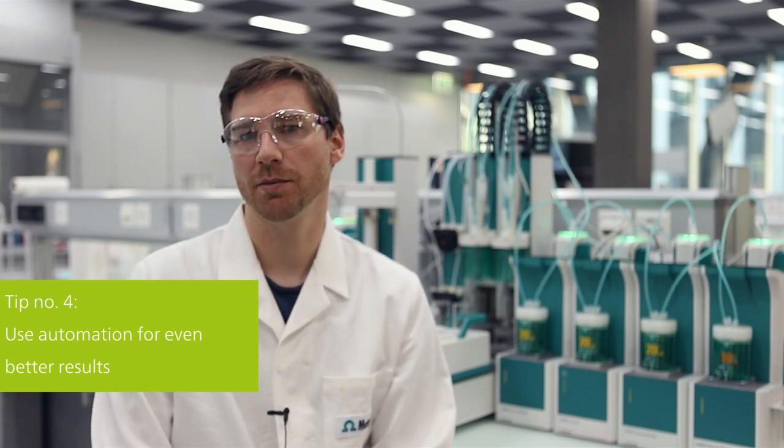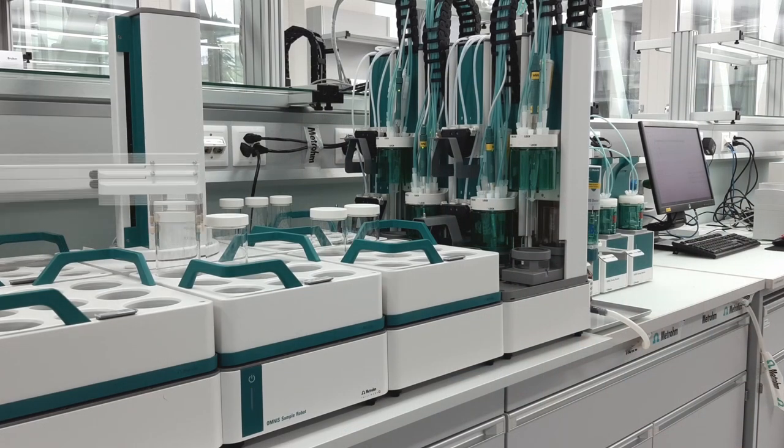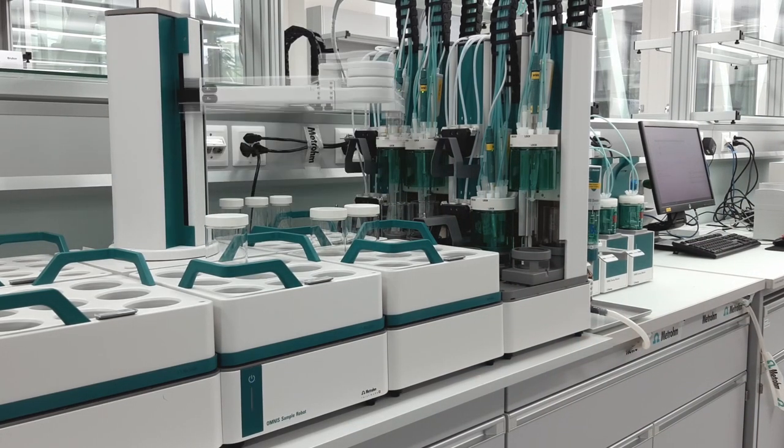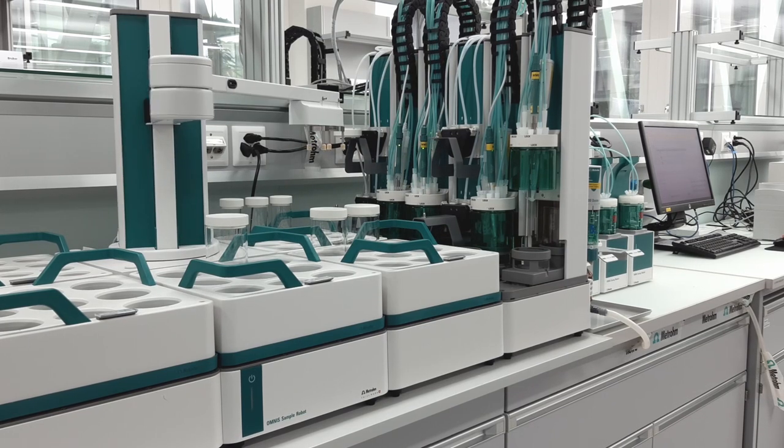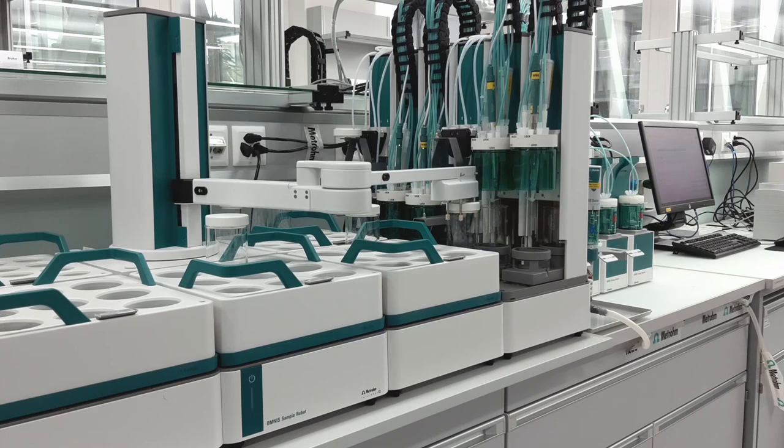Use automated systems. Automation of the cleaning and conditioning of your electrode is your best bet to make sure your results are reproducible. Also, automation frees up time that you can use for other tasks.